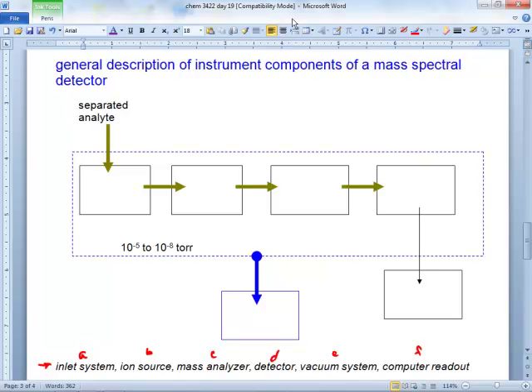All right, let's see if we can fill this stuff in. This first box, for me personally, is what really sucks. It gives me something to do, which is job security. Think of it as a liquid chromatograph or gas chromatograph.